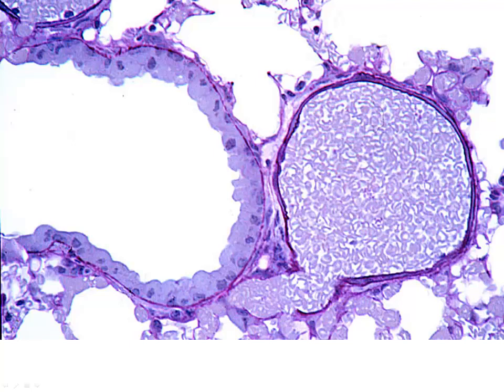Now, as we get closer to the end, as we begin to get in our respiratory area, we're going to see more and more of these dome-shaped, very tall cells lining this passageway. You can see we've pretty much lost the cilia. We're not pseudostratified any longer. It's almost a single layer of cells that we see. And these round domed cells look a lot like transitional epithelium. These are going to be our Clara cells that are on the surface of our airway.